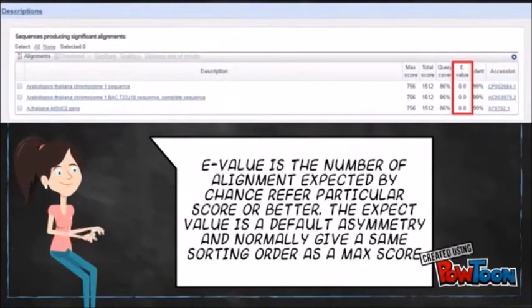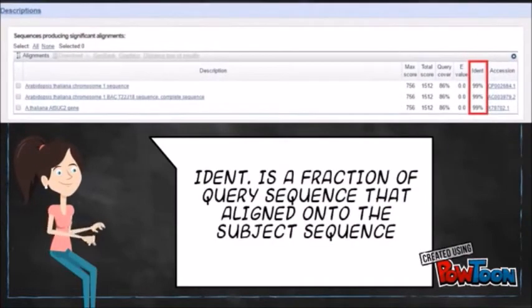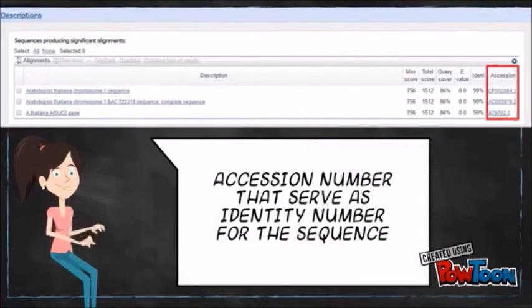While the e-value is the number of alignments expected by chance with a particular score or better. The expect value is the default sort metric and normally gives the same sorting order as max score. Ident is the fraction of the query sequence that aligns to the subject sequence. And the most right column is the accession number that serves as an identity number for a sequence.